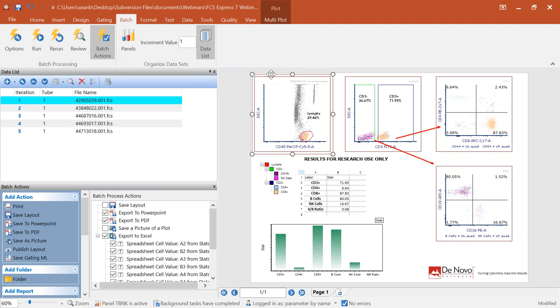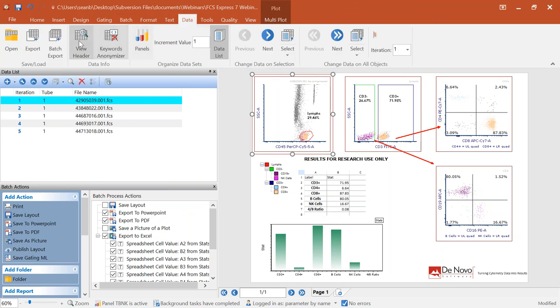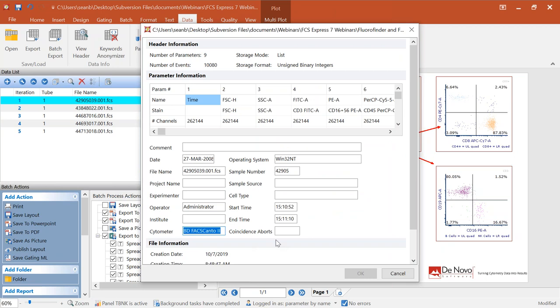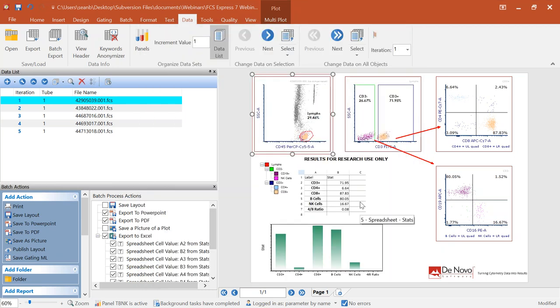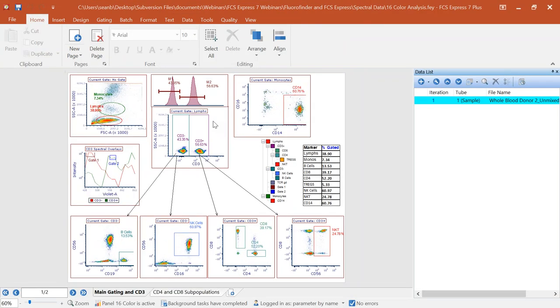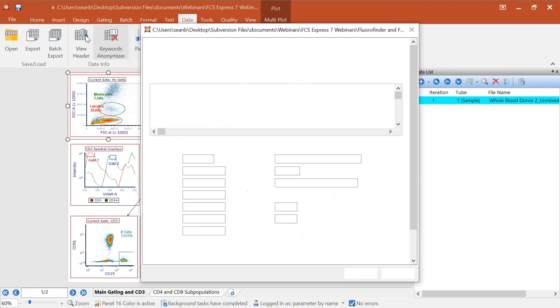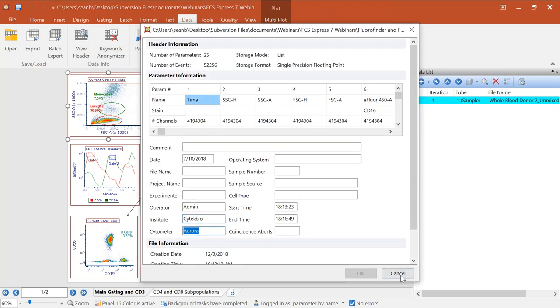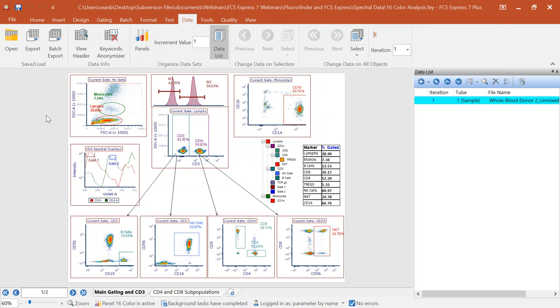What we've done here today is look at some conventional flow cytometry data — this data file was acquired on a BD FACSCanto, a conventional cytometer. FCS Express also has the ability to work with data from any spectral cytometer. I'd like to show you some of the tools that are kind of special for working with spectral data.